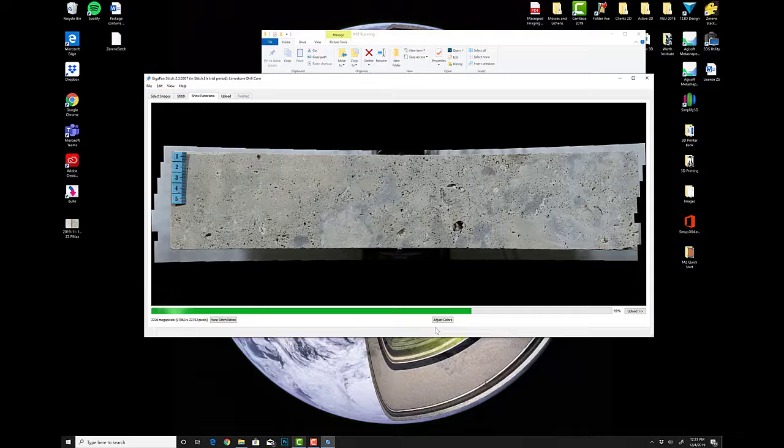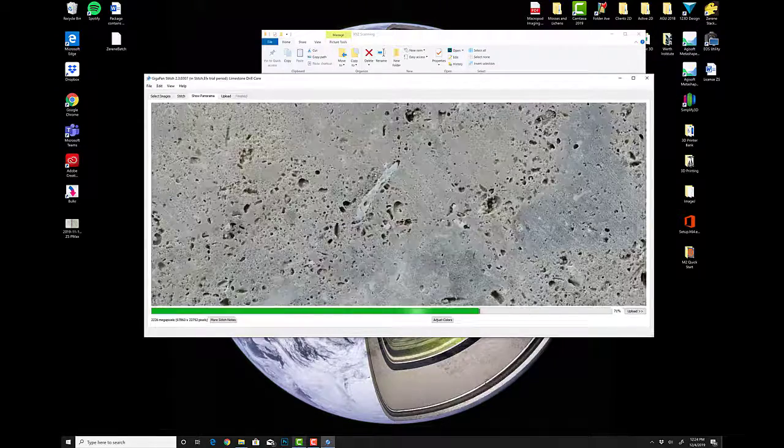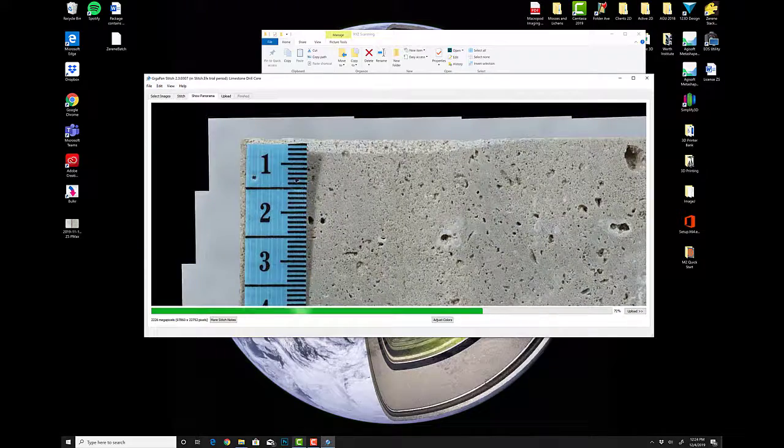Okay, so I walked away from my desk for a minute, but just now back. So you can see we're about 12 minutes in. Most of the stitching is already in place. Now what it's doing is it's going through and just blending together each of the images, but you can see here we've got a very high quality result with very little to no artifacts whatsoever.